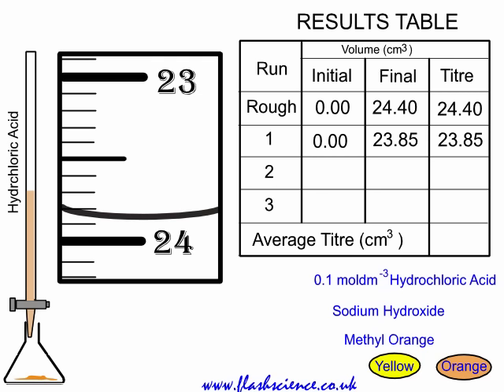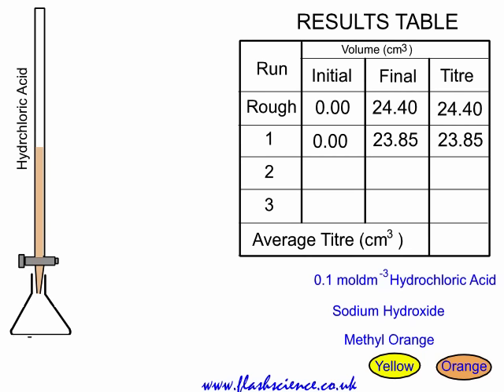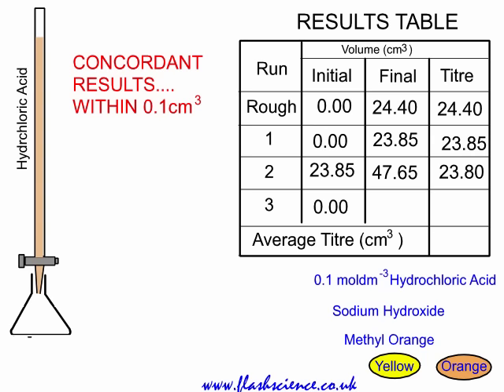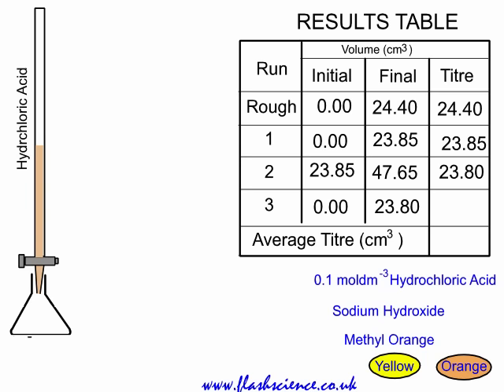You empty out the contents of the conical flask and rinse it well with deionised water. Because a burette can measure up to 50 cubic centimetres, you don't need to top it up again — there's enough to do the second accurate run. So the initial reading is 23.85. You obtain an accurate titer; in this case the final reading is 47.65. Take the difference between the initial and final, and the second accurate titer is 23.80. These are concordant results — runs 1 and 2 are within 0.1 cubic centimetre of each other.